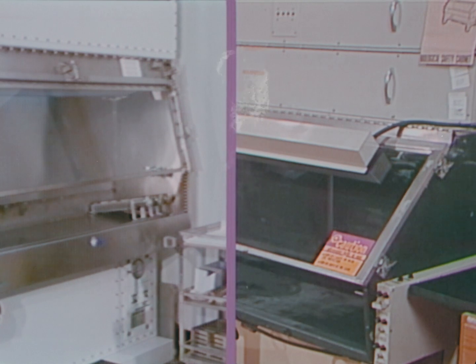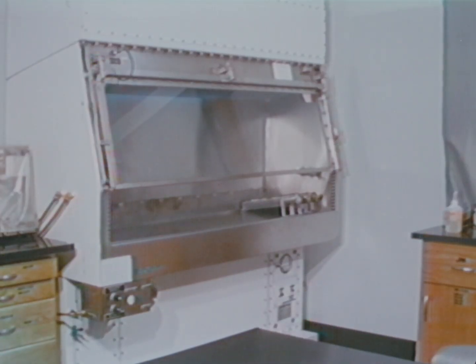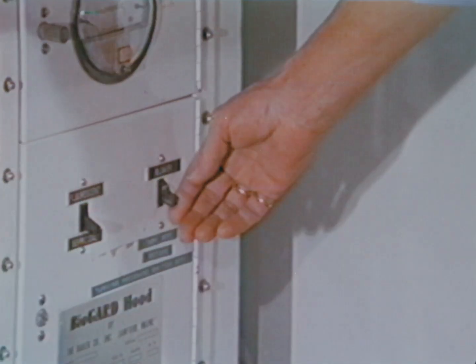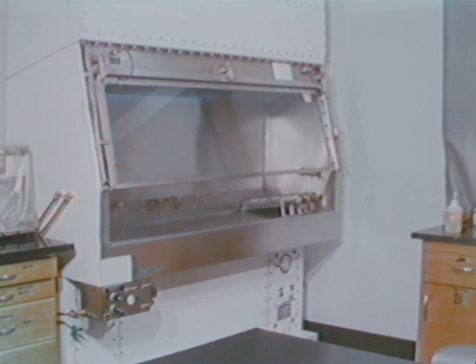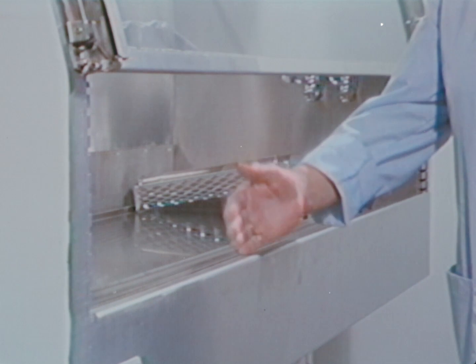The laminar flow cabinet and negative pressure cabinet are similar in dimension and construction. The laminar flow cabinet recirculates 80 to 90 percent of its air through HEPA filters, resulting in a cleaner working area for the microbiologist. For this reason, the blower must be turned on at least five minutes before work is begun. This will establish the air barrier and purge the working area. The 10 to 20 percent of air drawn into the front provides an air barrier. This barrier limits the number of room contaminants reaching the work area and virtually eliminates the movement of pathogens back into the room.